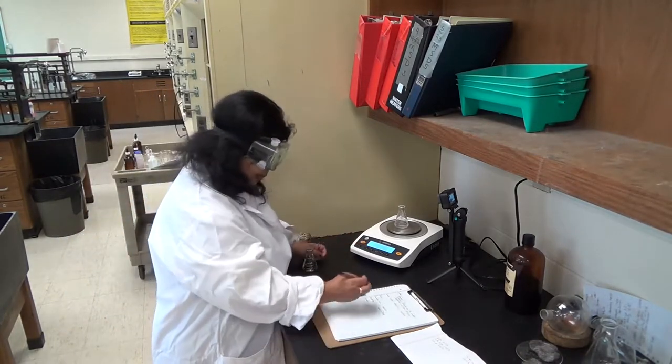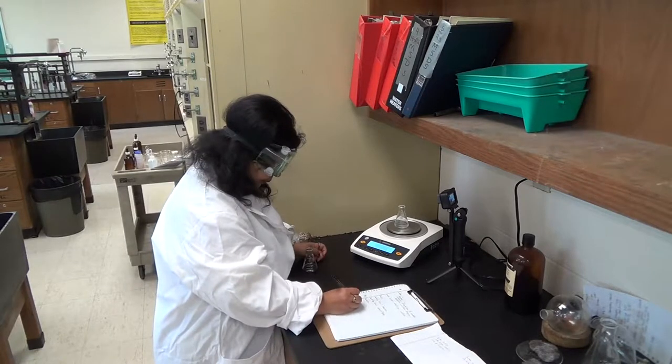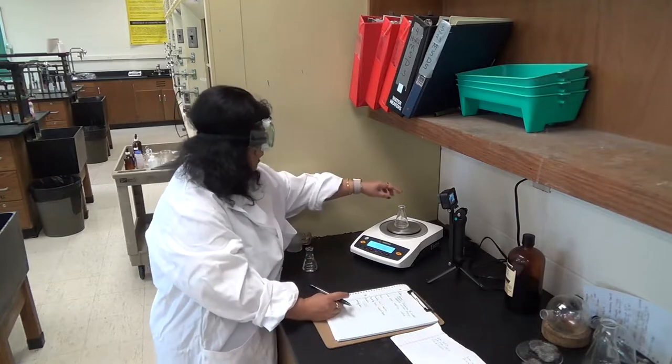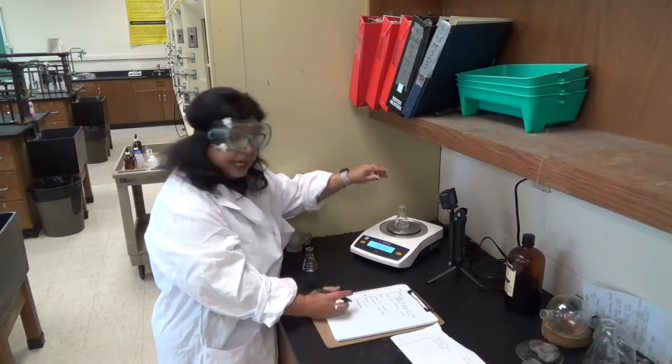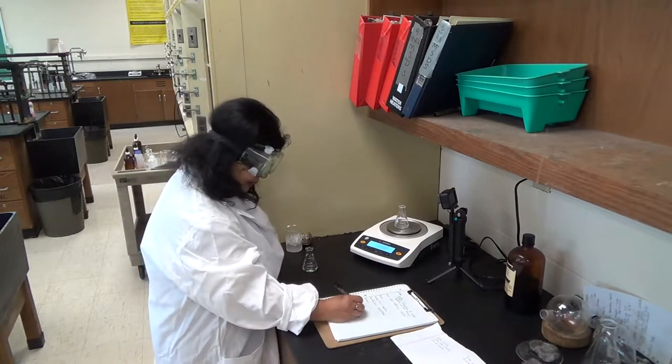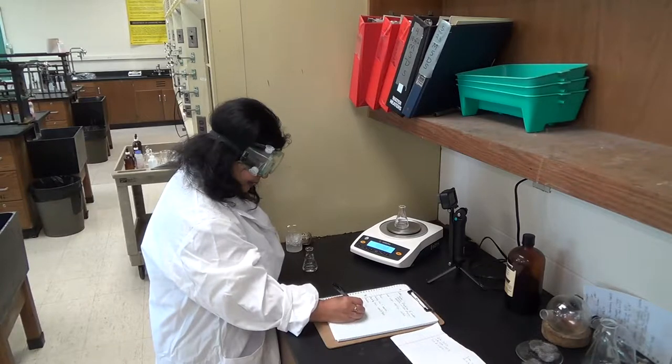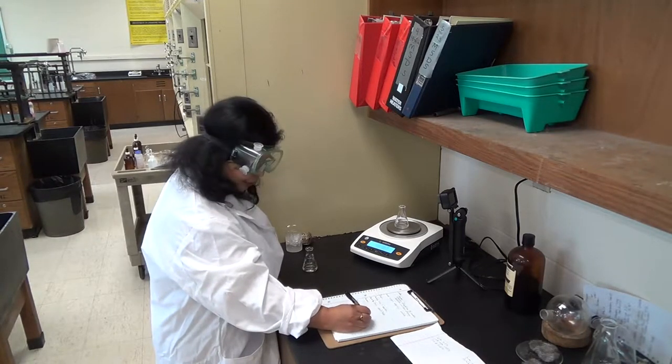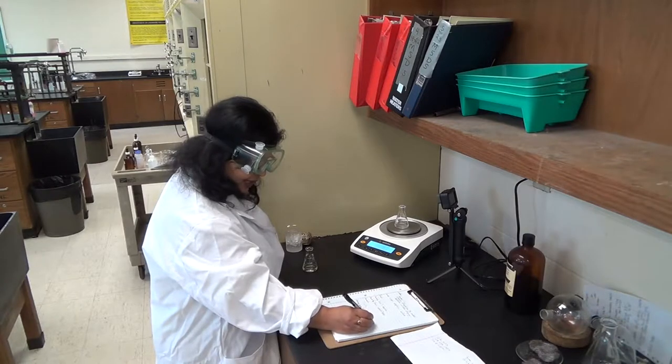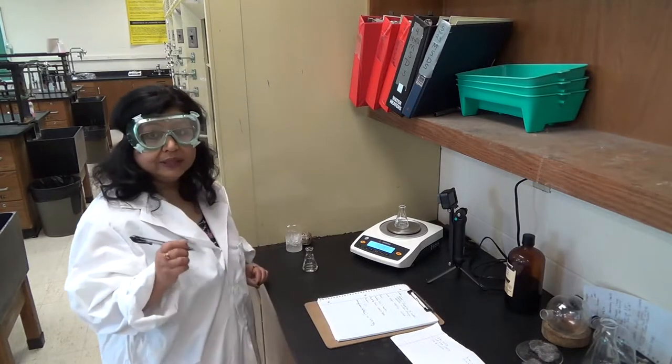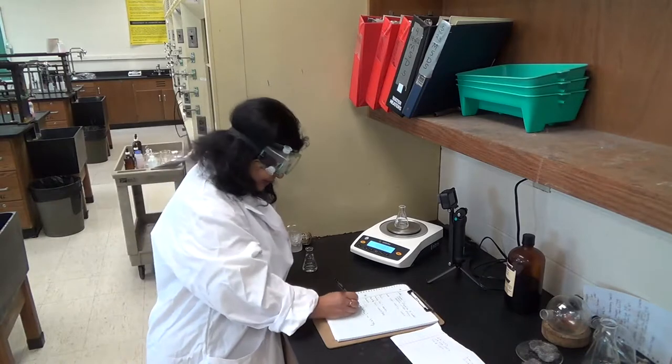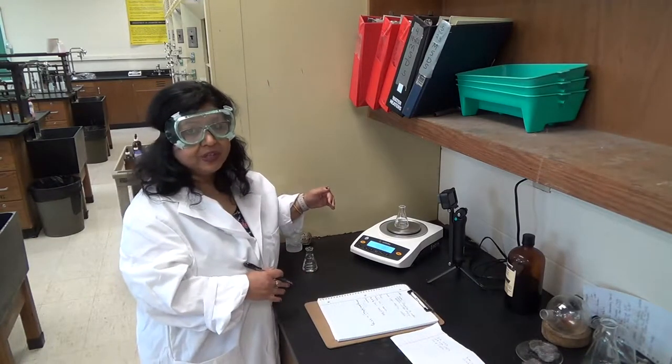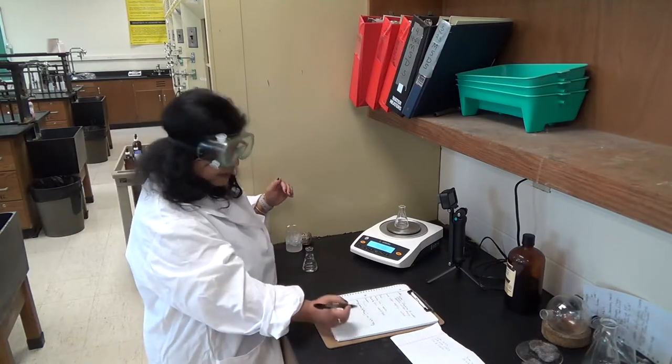So this weighs, so this is my flask with calcium nitrate, and it's weighing 49.78 grams with the flask. Okay, so mass of the flask plus calcium nitrate is 49.78 grams.